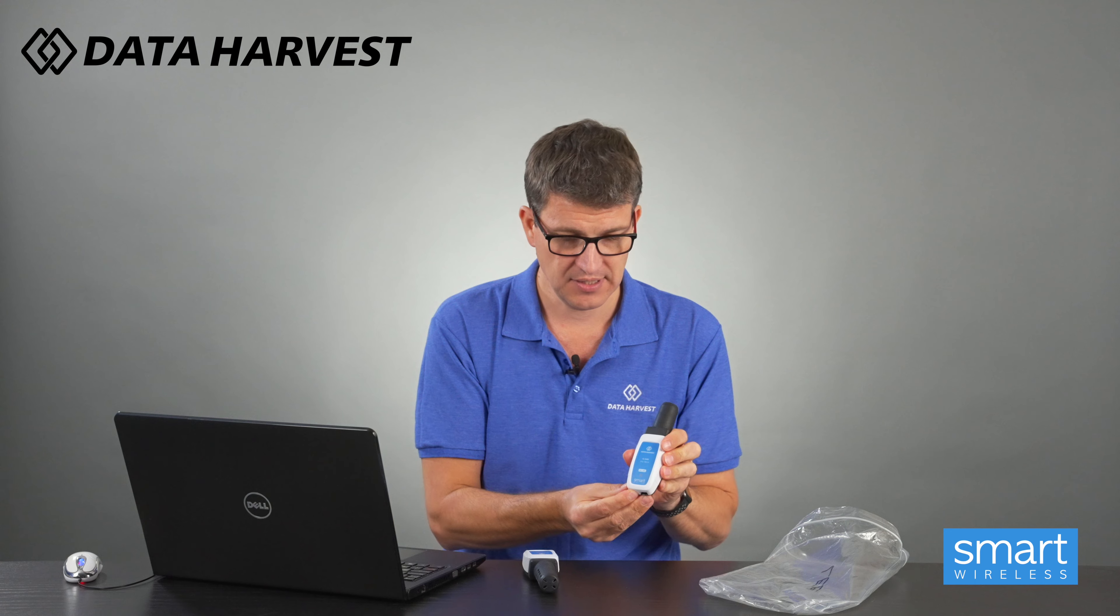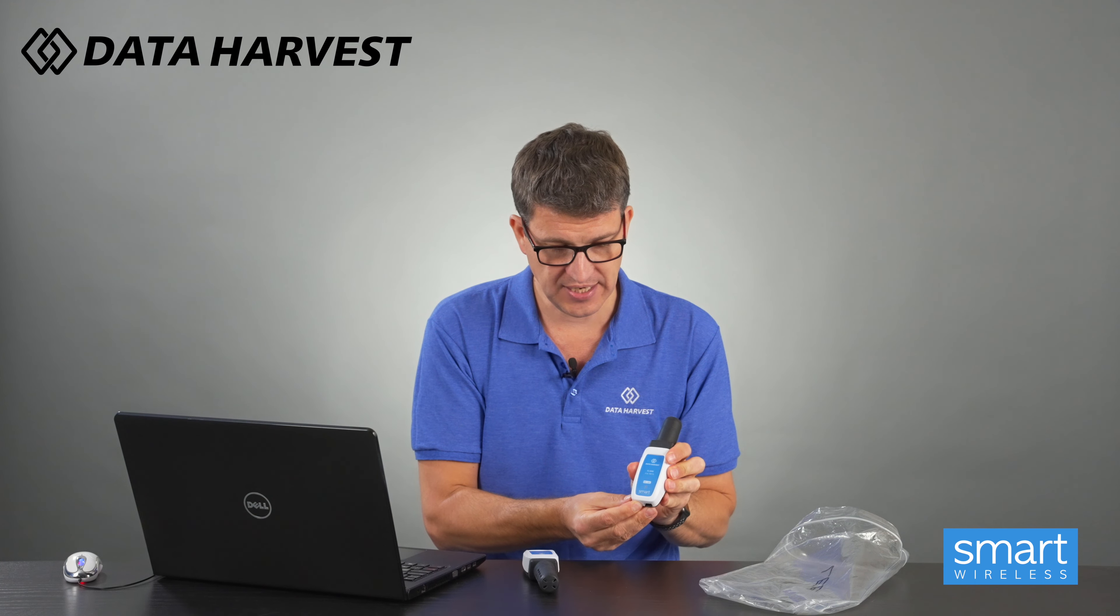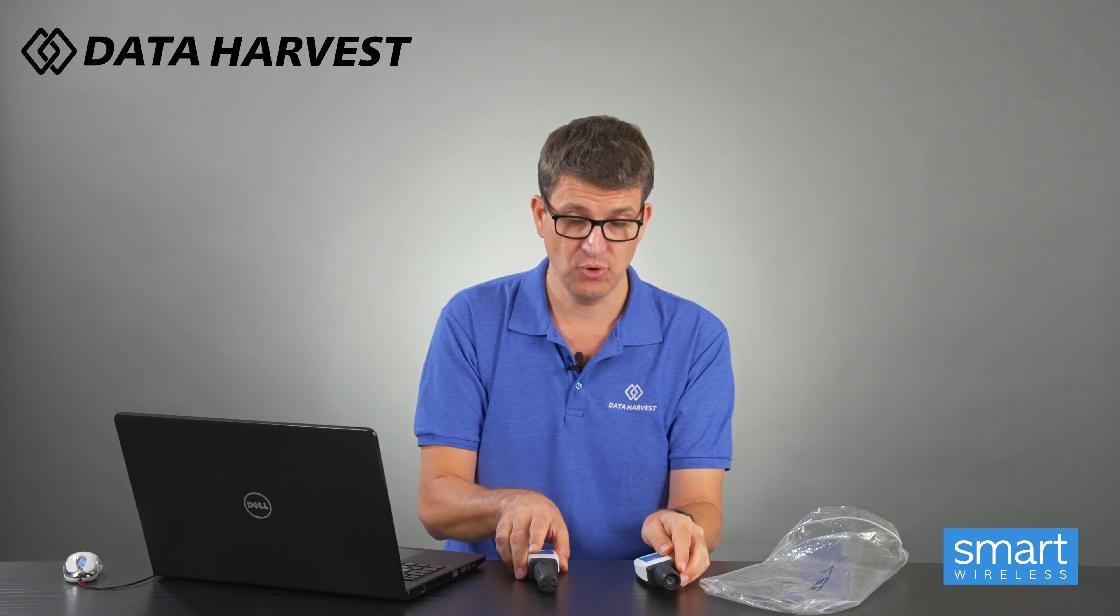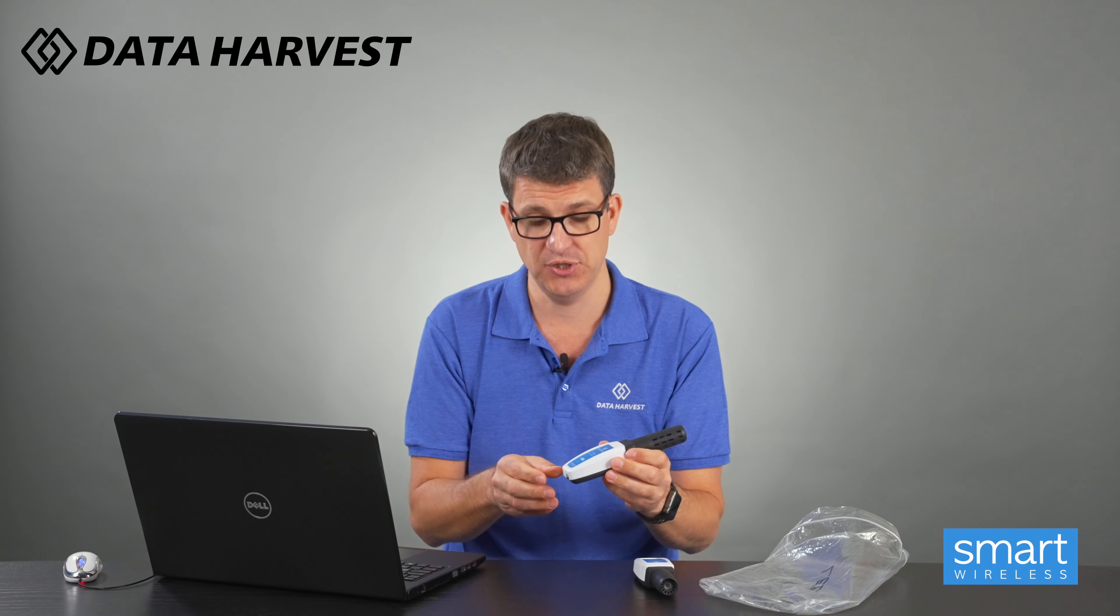So to start off with, I'm going to turn each of these on, so it takes two seconds just to hold it down and it starts flashing blue. That's now broadcasting our Bluetooth.